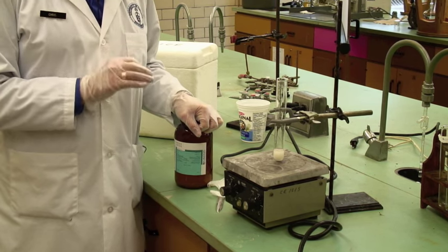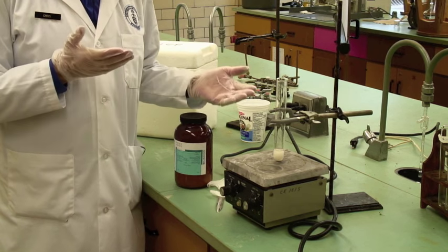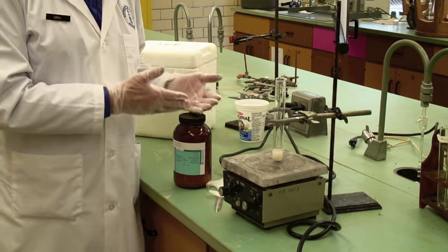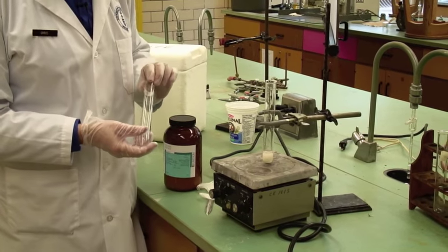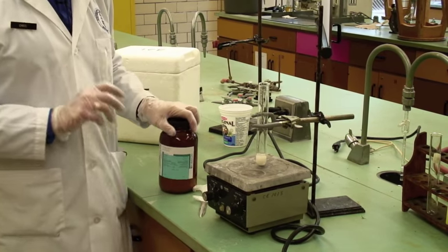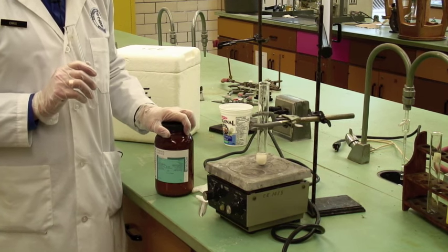You will be making up several mixtures in different proportions of phenol plus water in just large test tubes. It's very low-tech equipment here, and you do that weighing out by mass.